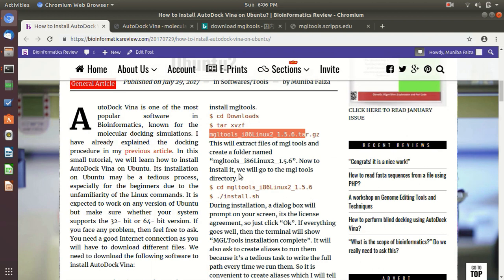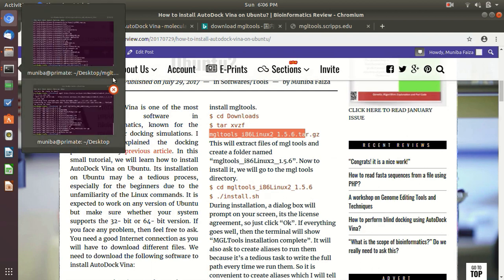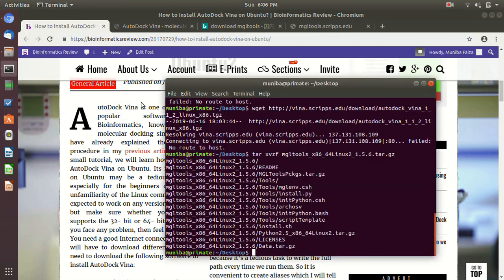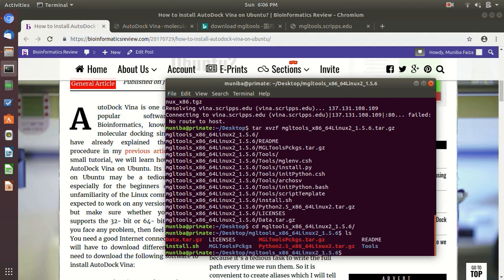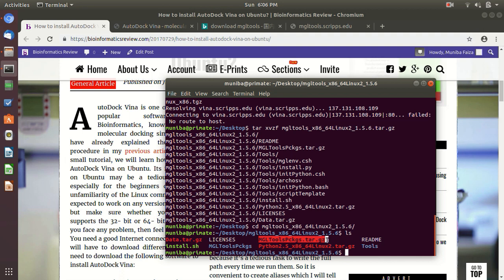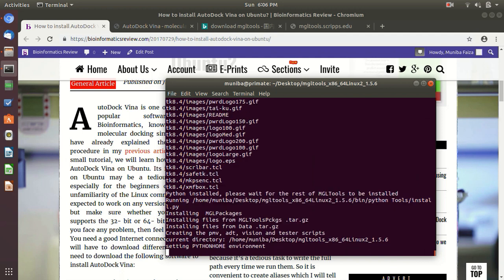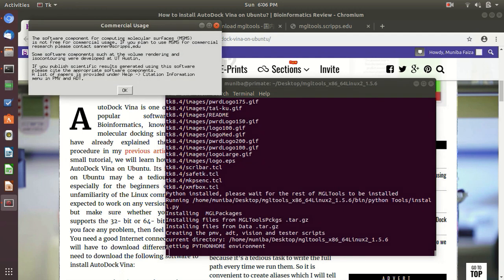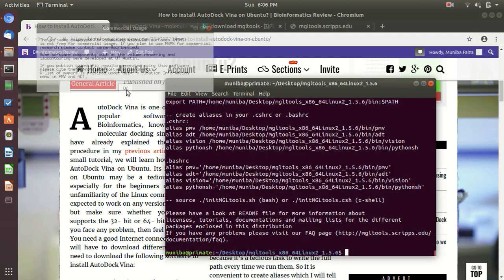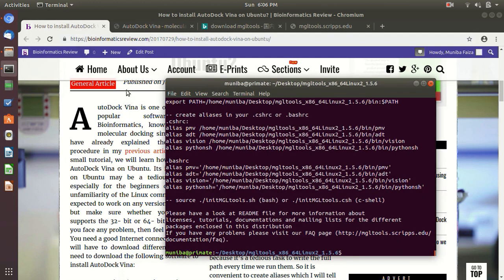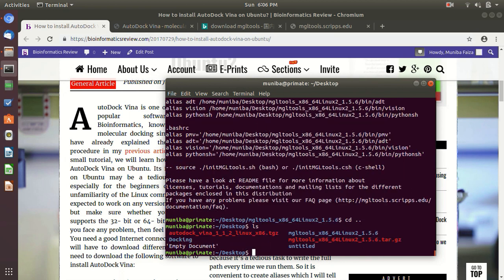Okay, so we have already untarred this MGL Tools. Now we are going to enter in this. Okay, cd space. Okay, here you see there are many packages. I have already untarred this one, MGL Tools packages, and now we are just going to install it. Dot slash install dot. Installing right now.